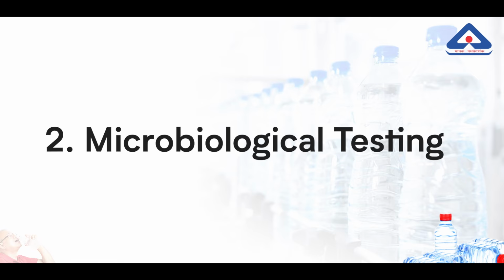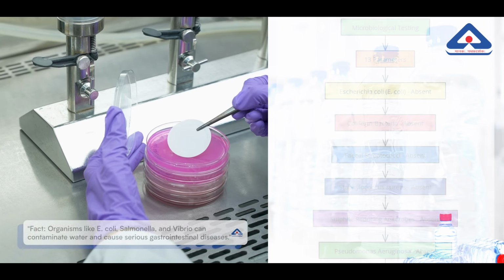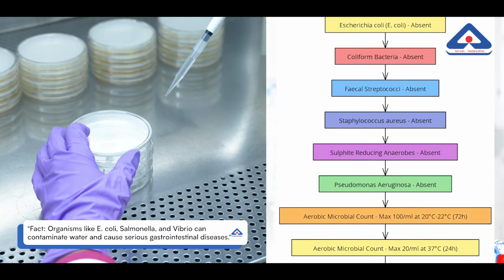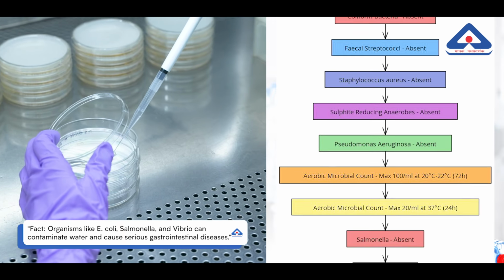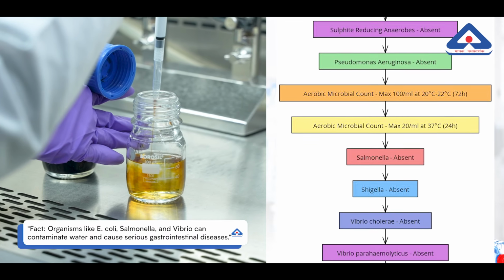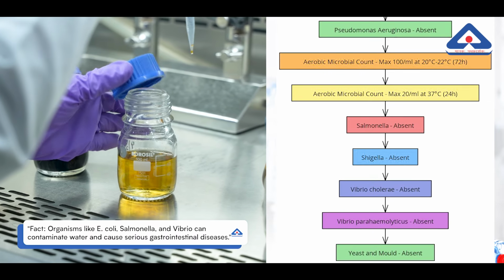2. Microbiological testing. Microbiological testing checks for harmful pathogens. 13 microbiological parameters are examined, ensuring the water is free from harmful microorganisms.